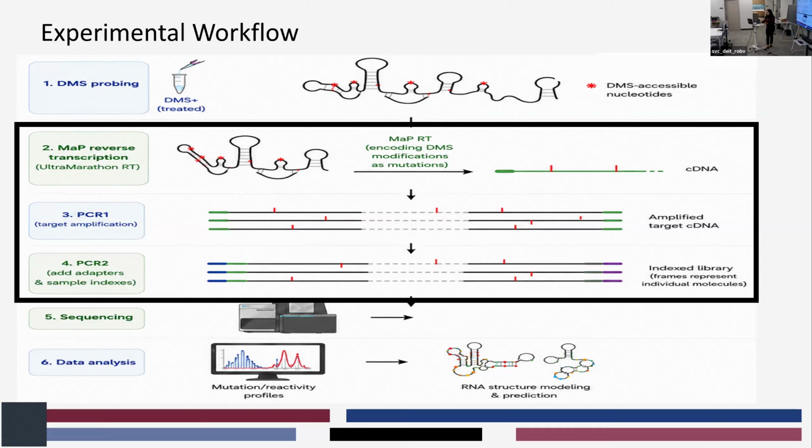After PCR, we use two instruments to check the DNA sample that we prepared, called our DNA library: the TapeStation and the Qubit. The TapeStation checks the size and quality of the DNA fragments. The Qubit measures the DNA concentration to determine whether we had enough DNA to do the sequencing.